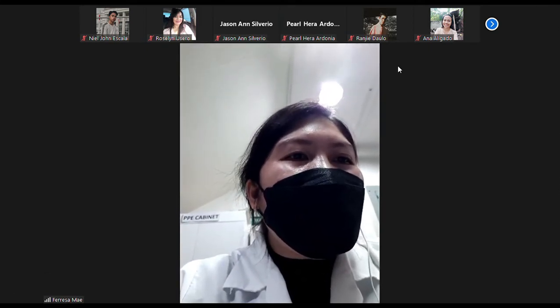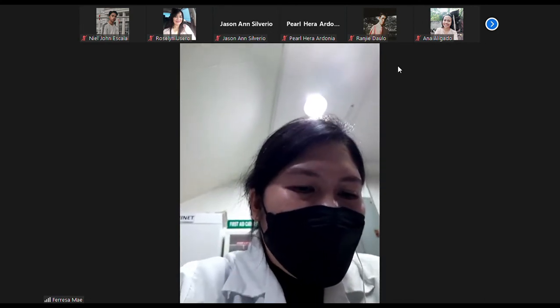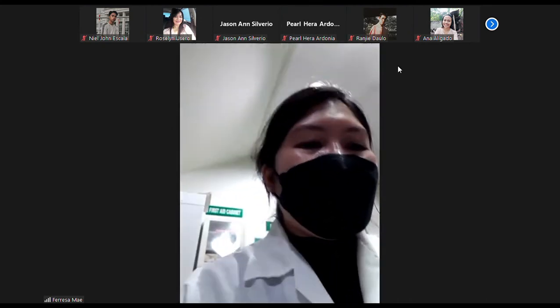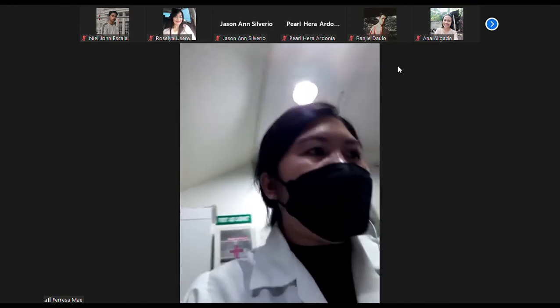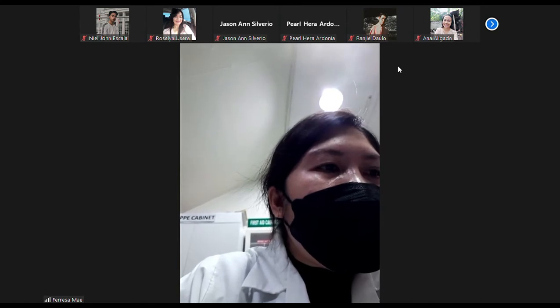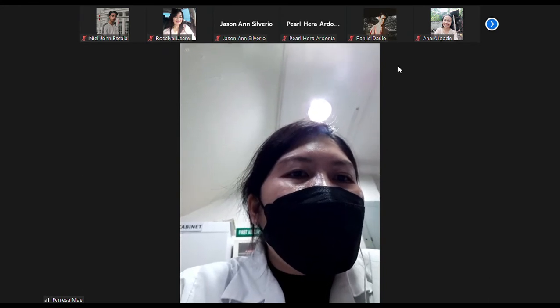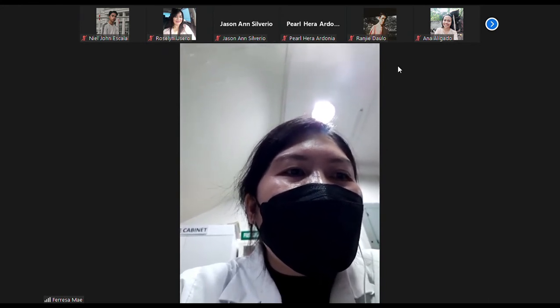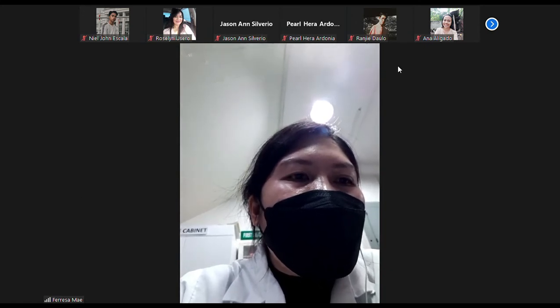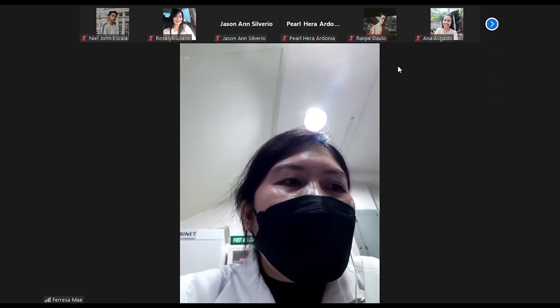So moisture determination in food. When we say moisture determination, it is the amount of water present in a food sample. The moisture determination is one of the most important and most widely used measurements in the processing and testing of foods. The stability and quality of foods is also affected by moisture content, hence it also has a role in the safety of foods.